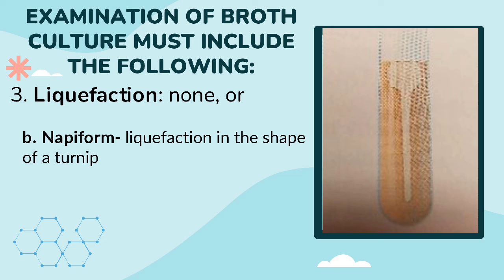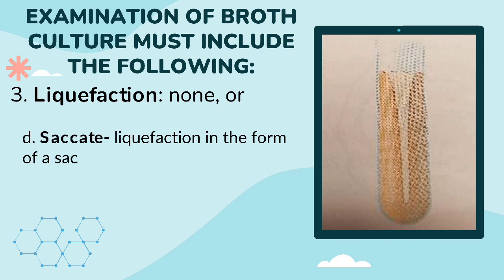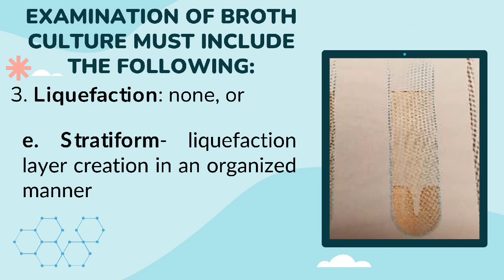Napiform, liquefaction in the shape of a turnip. Infundibulum, liquefaction in the shape of a funnel. Saccate, liquefaction in the form of a sac. Stratiform, liquefaction layered in an organized manner.